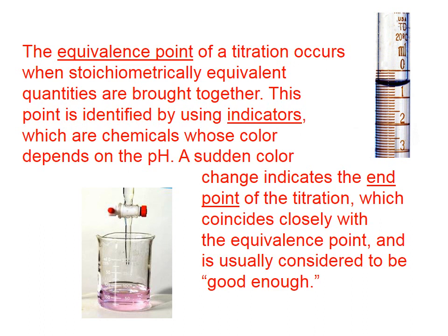You can see in the lower left here, we must have added the indicator phenolphthalein. Phenolphthalein is this pinkish or magenta-like color in basic solution.